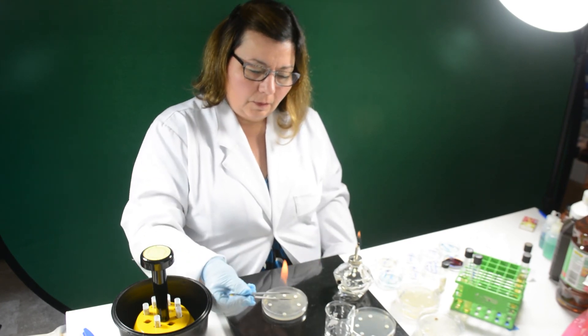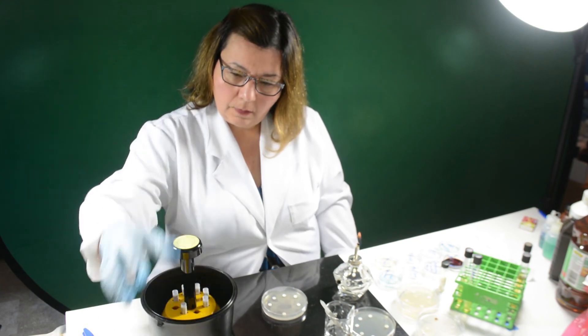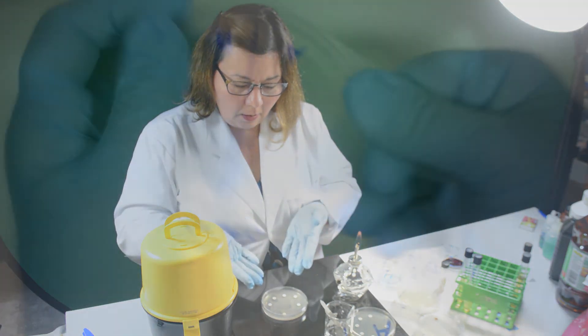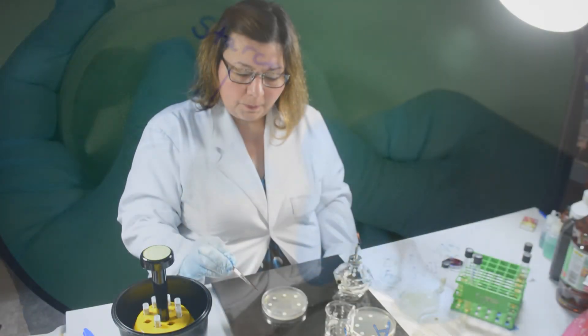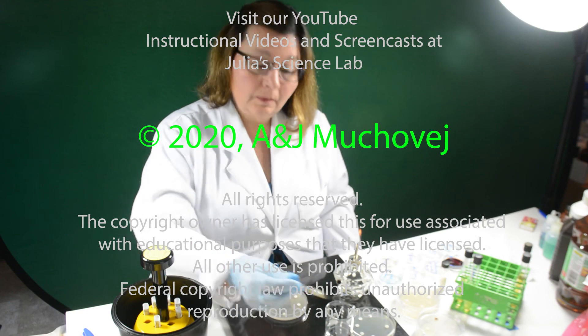Once all discs are in place, place the lid back on the plate and let it stand for a few minutes. This will allow the dry disc to adhere to the surface of the agar. Then seal the plate with parafilm, invert the plates, and place them in a 35 degrees Celsius incubator for 16 to 18 hours.